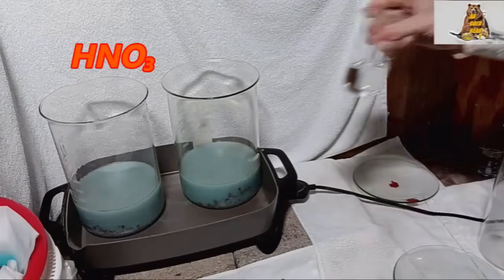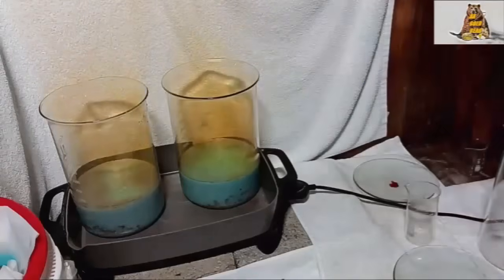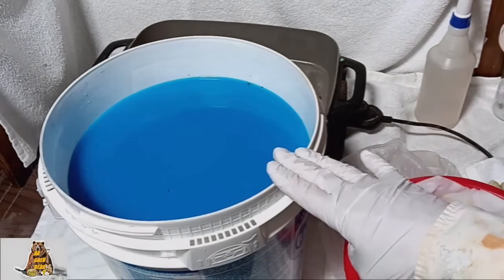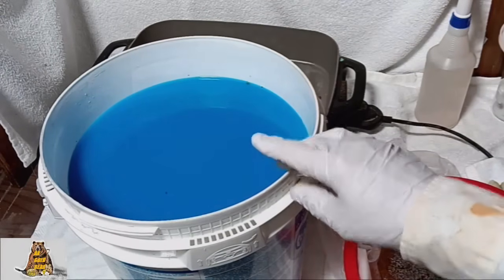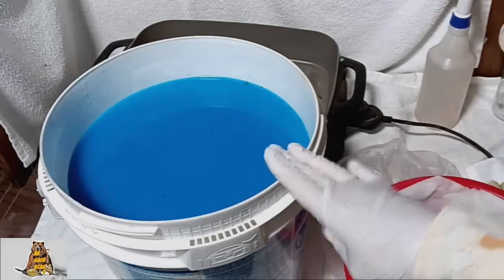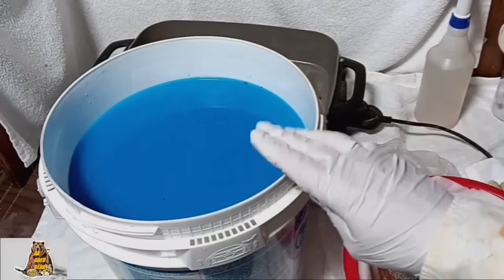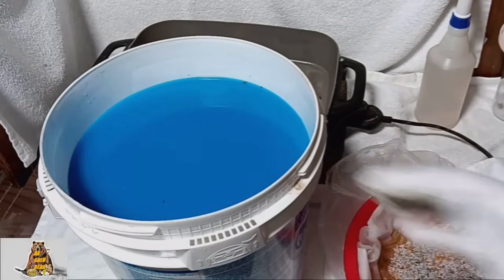200 ml of sulfuric acid and 100 ml of nitric acid. Okay, all copper, all the base metal have dissolved. It took me 6 hours to dissolve the base metals. I have a full bucket of copper nitrate now. To get copper sulfate from copper nitrate I have to evaporate half of this liquid. But first I will wait a couple of days — at least two days. I need all the dirt, all the chlorides to sink to the bottom. I need clean copper nitrate solution.